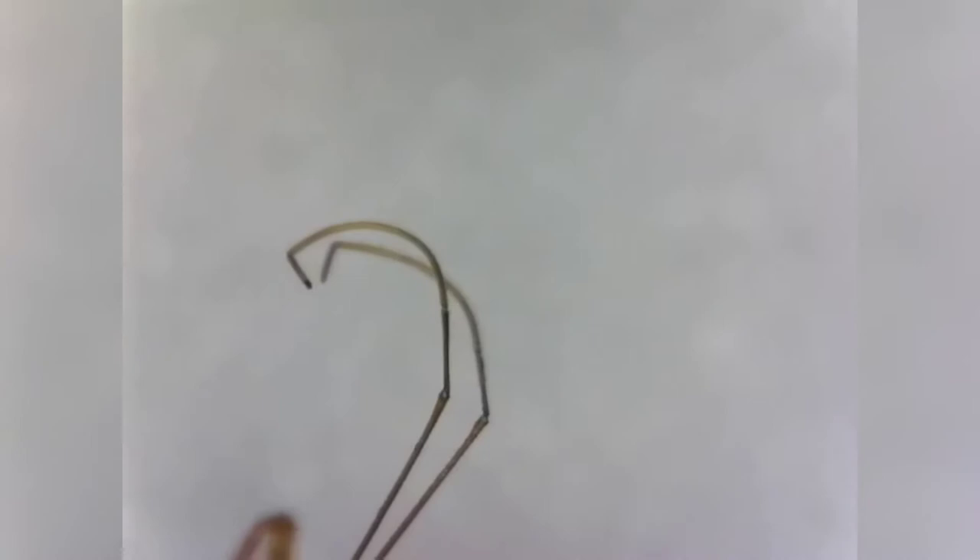Couplet 11 asks whether the antennae are four-segmented or five-segmented. Taking a quick look: there's one segment at the tip, the second is curved, then the third long one, and you can see the fourth little segment connecting to the front of the head. So this is a four-segmented antenna, which means we move on to number 12.